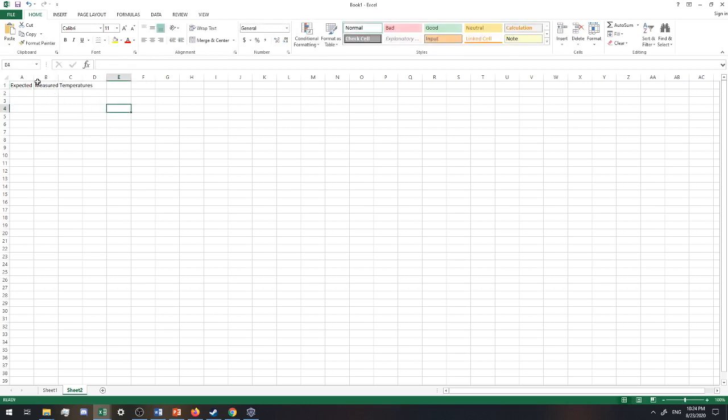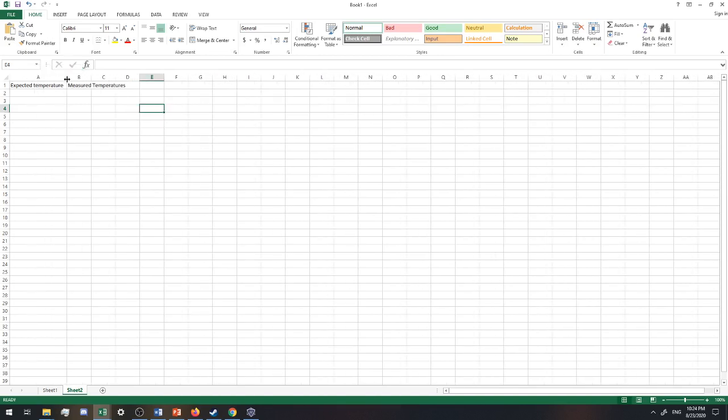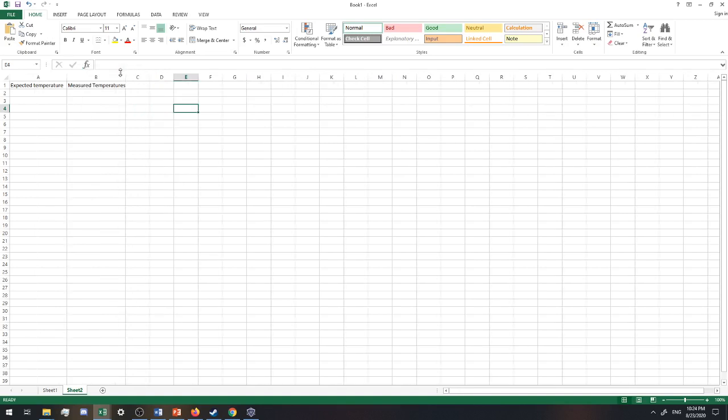Now, I can't see everything, so if you go up to the top here, you'll notice that the shape of the cursor switches into this line with two arrows on either side. If you click on that, you can then adjust your column, and I'm going to do that to open it up and make it the size for these things so that the names fit.